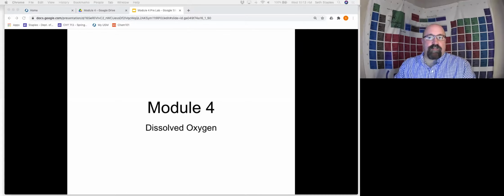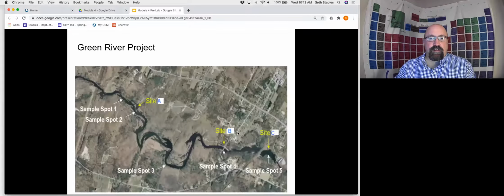Hello, this is our pre-lab discussion for Module 4 in CHY 114, our dissolved oxygen unit. And so remembering our Green River project, we are investigating the water quality issues along the Green River. And so far in modules 1 through 3, we've really been focusing on looking at specific pollutants and specific issues that might be affecting the water quality.